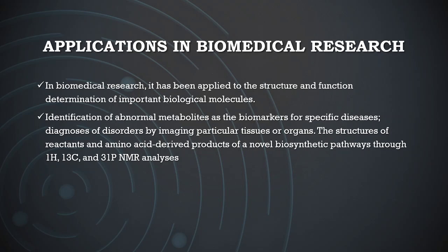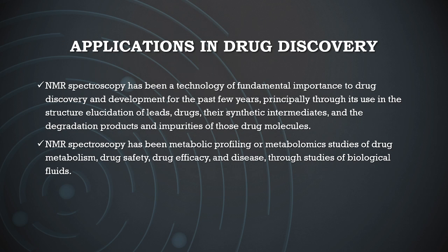Now coming towards the next slide, that is applications in drug discovery. NMR spectroscopy has been a technology of fundamental importance to drug discovery and development for the past few years, principally through its use in the structural elucidation of leads, drugs, their synthetic intermediates, and the degradation products and impurities of those drug molecules.